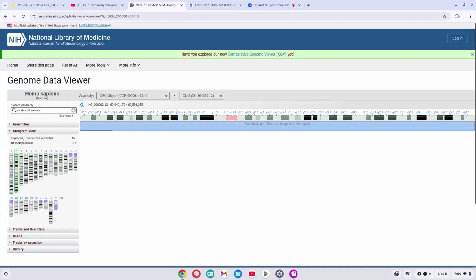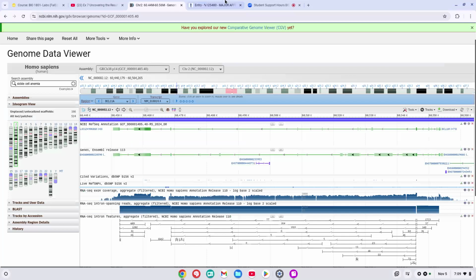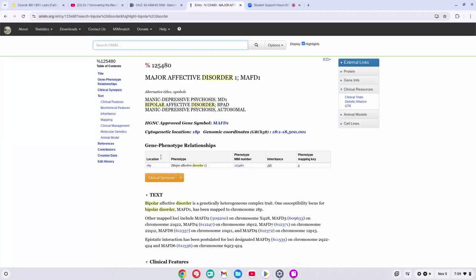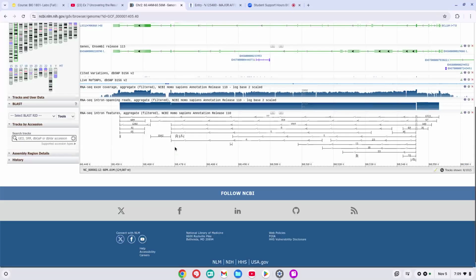And again, you can do the same thing in here. You can go in, you can see that specific chromosome length, and you can get the gene name and or the gene location name, and you can type it in here and get some of the information that way, or you can blast it. So you got that view again.